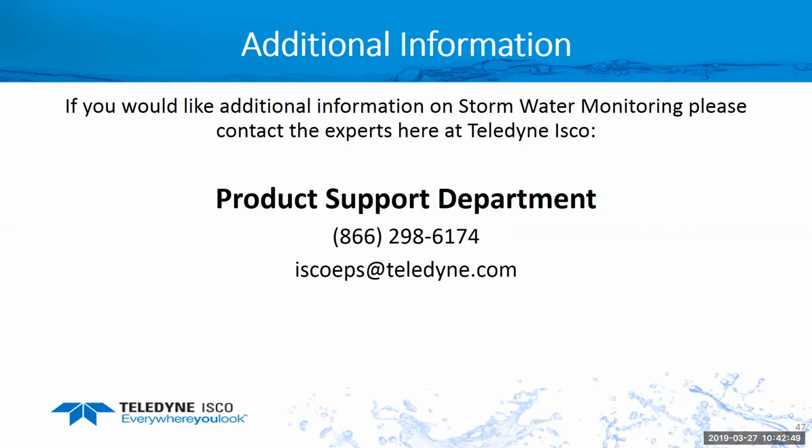The RTD hasn't changed. So someone also asked, do I need a new RTD? No. The RTDs haven't changed technology. At worst case, we have some bin files that we haven't needed to update in years, but if you have something that's really old, you could check the firmware in that, and we can get that updated as well.